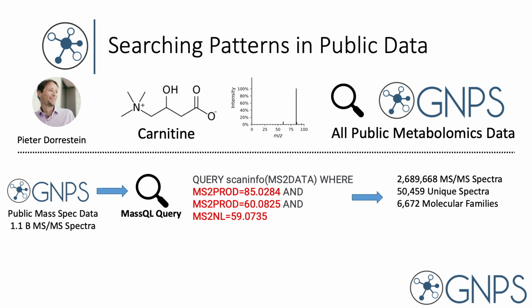And again, we were able to reduce it from 1.1 billion MS/MS down to about 2 million MS/MS matches and about 50,000 unique MS/MS spectra in 6,000 families. So definitely a lot to mine, but at least it gives people the power to ask these questions flexibly themselves.